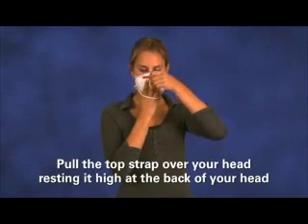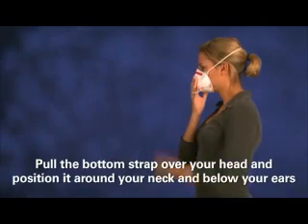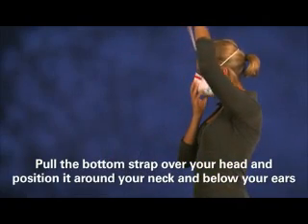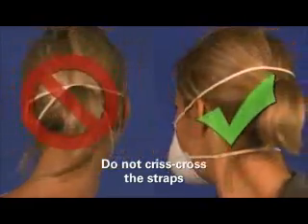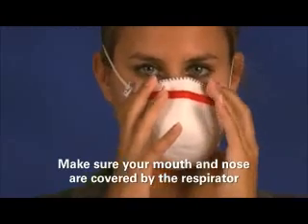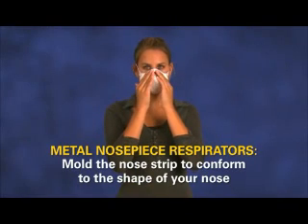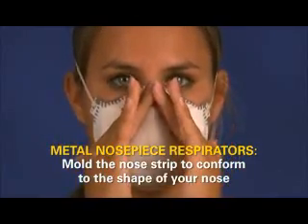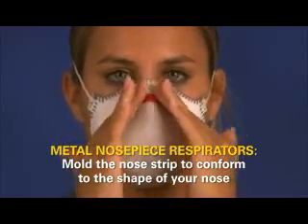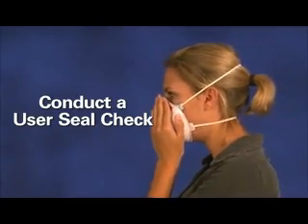The nose piece should span and cover the bridge of your nose, and the respirator should cup your chin. Pull the top strap over your head, resting it high at the back of your head. Pull the bottom strap over your head and position it around your neck and below your ears. Be sure not to crisscross the straps. Make sure that your mouth and nose are covered by the respirator. If the nose piece has a metal nose piece or strip, use both hands to mold the nose strip to conform to the shape of your nose by pushing inward while moving your fingertips down along both sides of the nose piece. Next, conduct a user seal check.